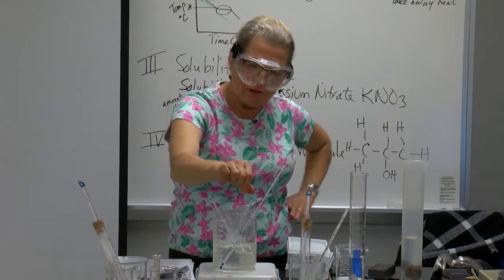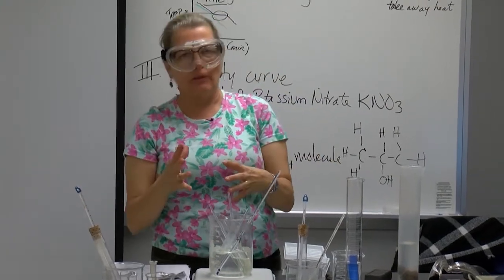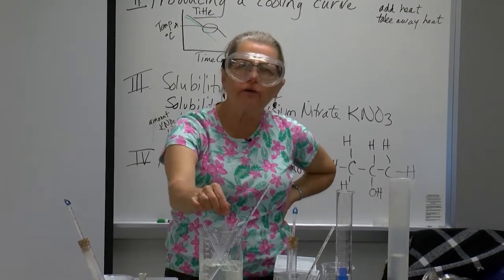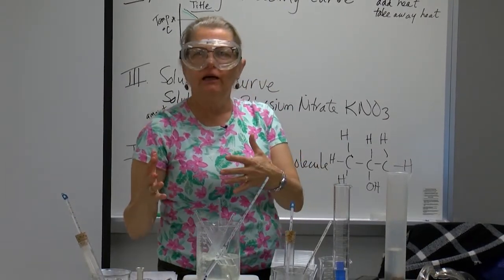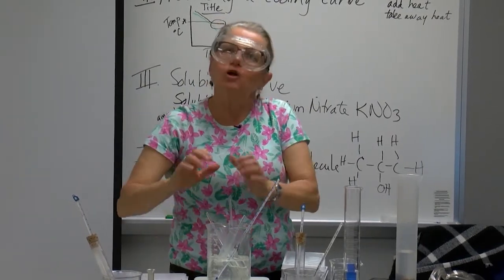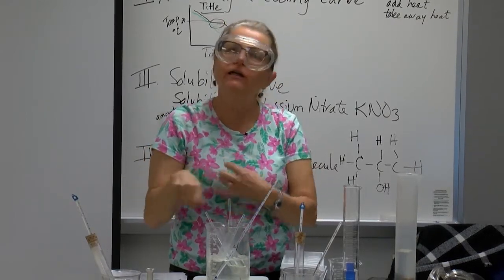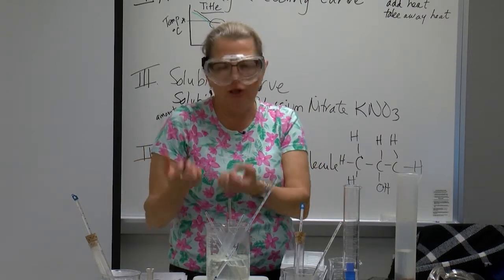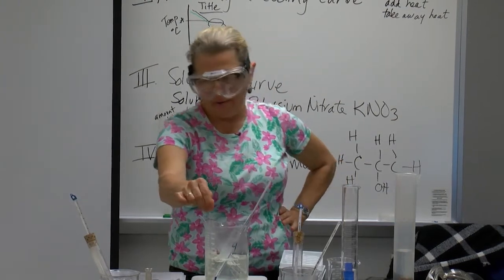Once it reaches the temperature, some of these are more saturated than others. Have you ever known someone who puts a lot of sugar in their coffee or their tea, and then they drink it real slowly, so eventually when they're all done with their cup of coffee, there's a bunch of sugar on the bottom? When it was hot, that coffee could hold all the sugar in solution. But as it cooled, as the molecules started moving slower and slower, some of the sugar falls out of solution, and that's basically what we're doing here.